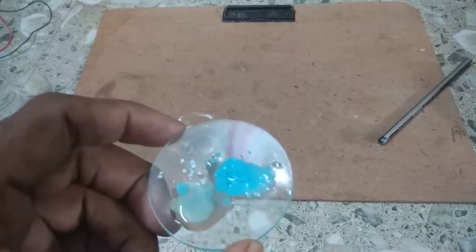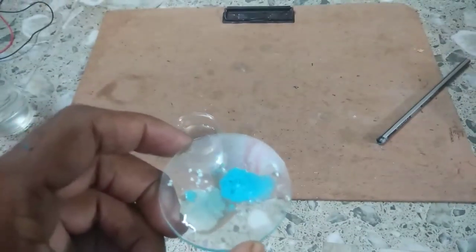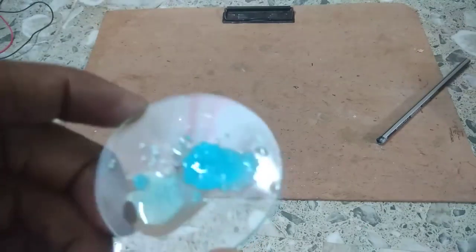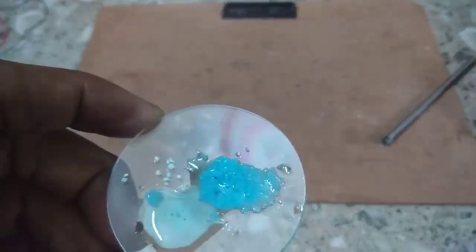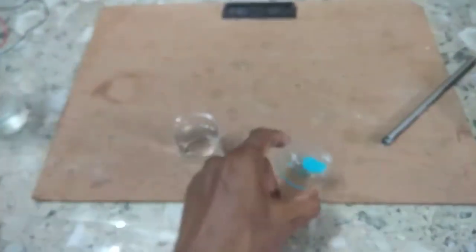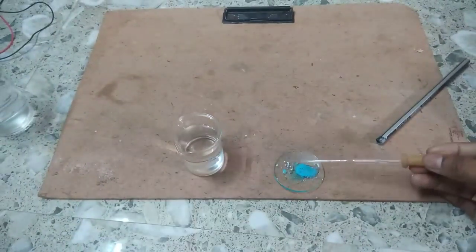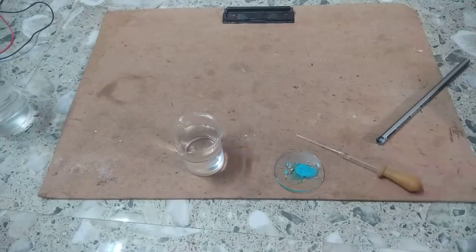That means it is a reversible change. When you heat the hydrated copper sulfate, that is CuSO₄·5H2O, it loses its water of crystallization, that is 5H2O, and turns white. And when you put water in this white anhydrous copper sulfate, it again changes into blue color. That means it is a reversible chemical change.